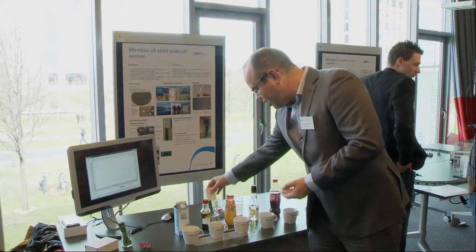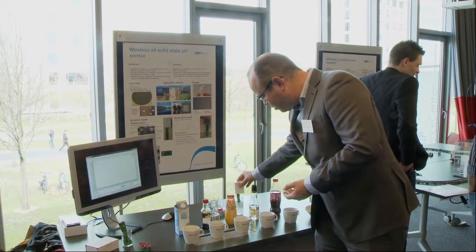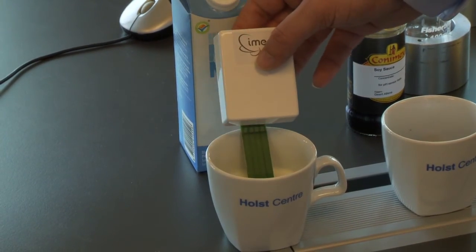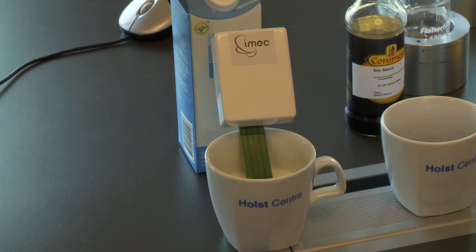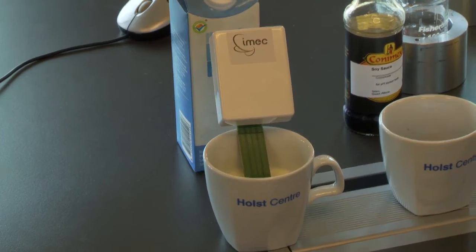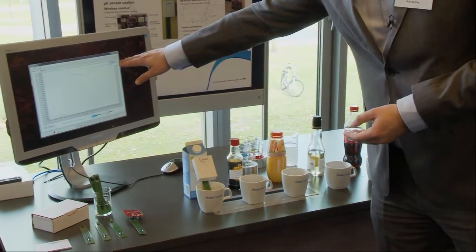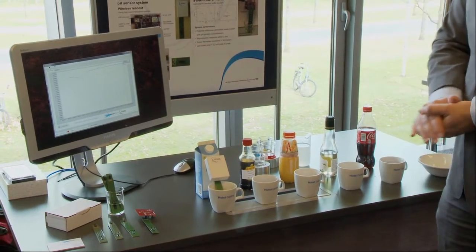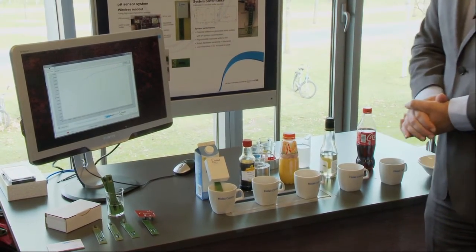As a demonstration, this is now a calibrated sensor which I immerse in milk. Milk is neutral, as you can also see, which has a pH around 7. So here it is slightly acidic.